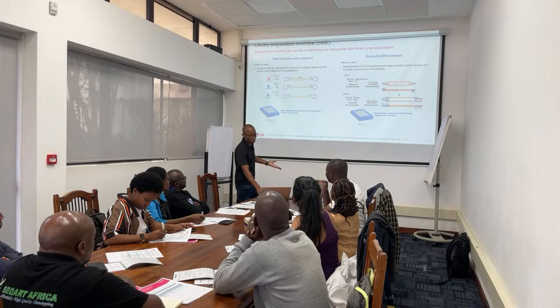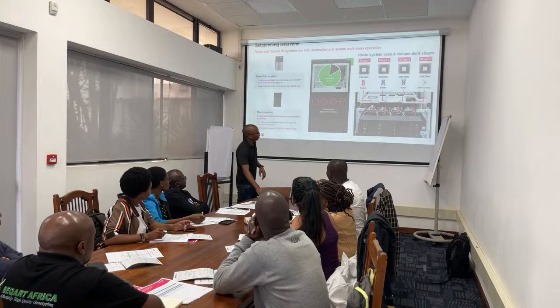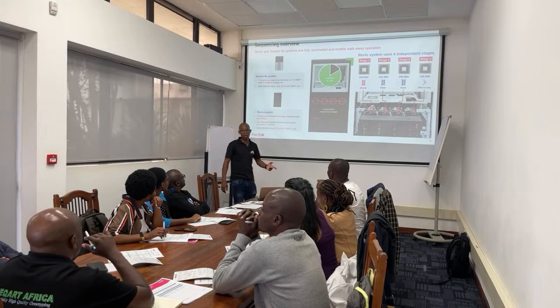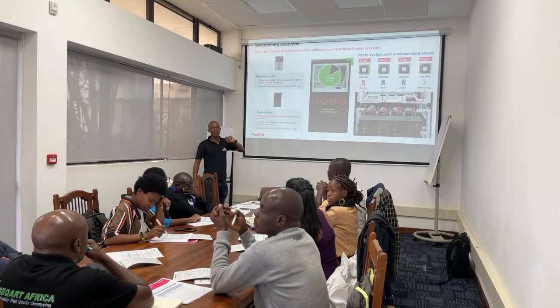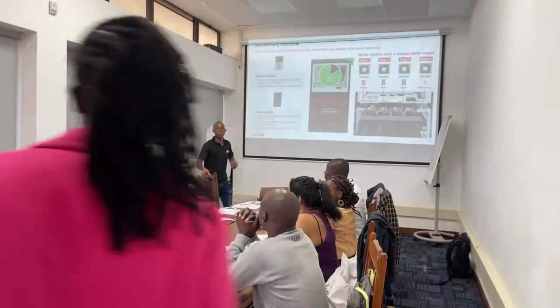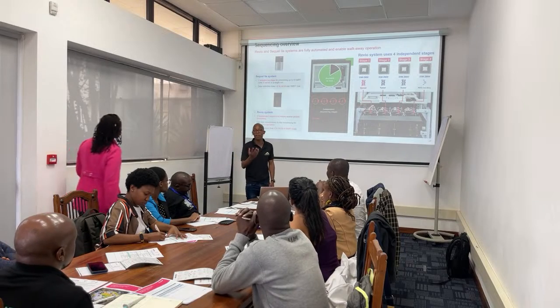But we're not going to do the barcoding today because it's one sample, so it's not necessary. We have that system at the top at the moment, called the Sequel IIe. If you're running HiFi for this genome, it will run for 30 hours straight.